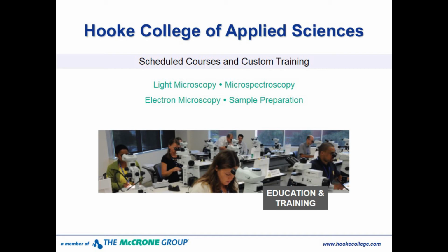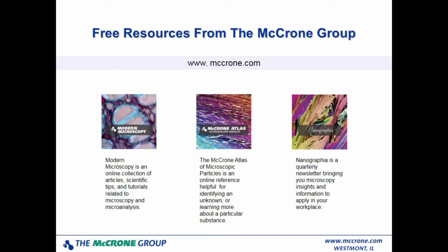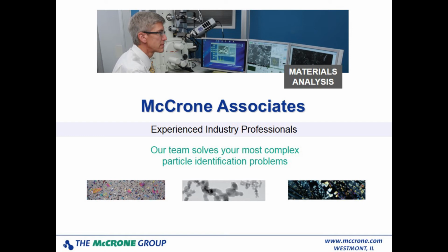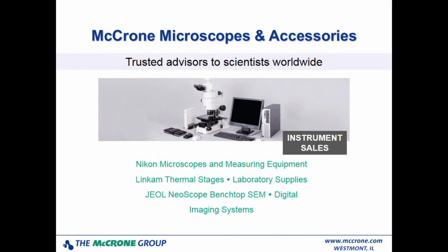Now that means that you do have to have sufficient skills at the PLM to use it early, and I think that just means that if you don't have those skills, it's very wise to get them. You may have a somewhat difficult time convincing people who are not familiar with the process that in fact, starting from the simplest and going to the more complex instrument is the wisest approach, and that may be a battle you can never win. But for your own work, based on some of the examples I gave where I didn't do that, I highly advise that you start from the simple and then work to the more complex.